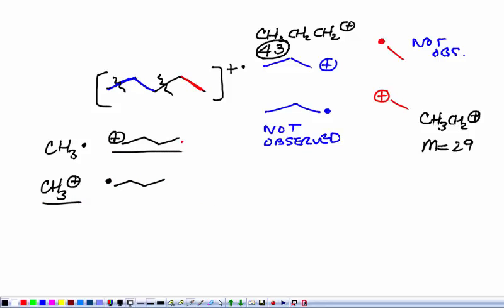And notice that I'm drawing primary carbocations, which in lecture would get you no points, and probably a big red mark, with usually, oh no, a primary carbocation written next to it, depending on the mood I'm in and how much time I have. But in the gas phase, primary carbocations are perfectly fine. They turn out to be stable. And so all these different primary carbocations that we can write in mass spec, but don't write them in lecture. But that's how the breaking of the bond goes.